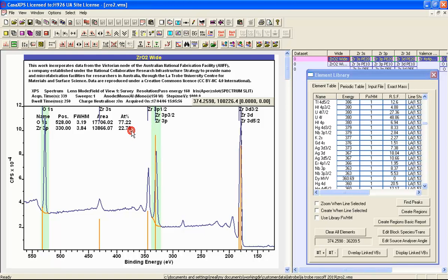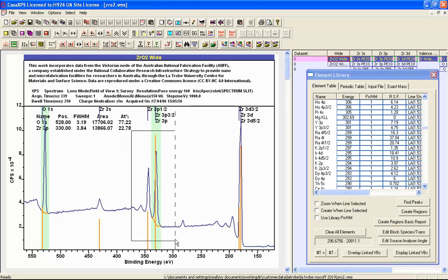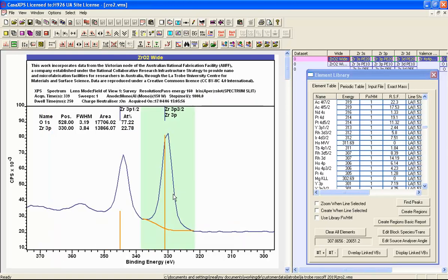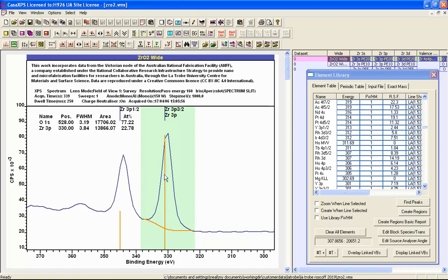The region that was created is based on a peak found within the region of the maximum that is associated with the zirconium 3p. In this instance, because the peak for the one-halves and the three-halves are sufficiently well resolved, a peak has been found that is simply the zirconium 3p three-halves.